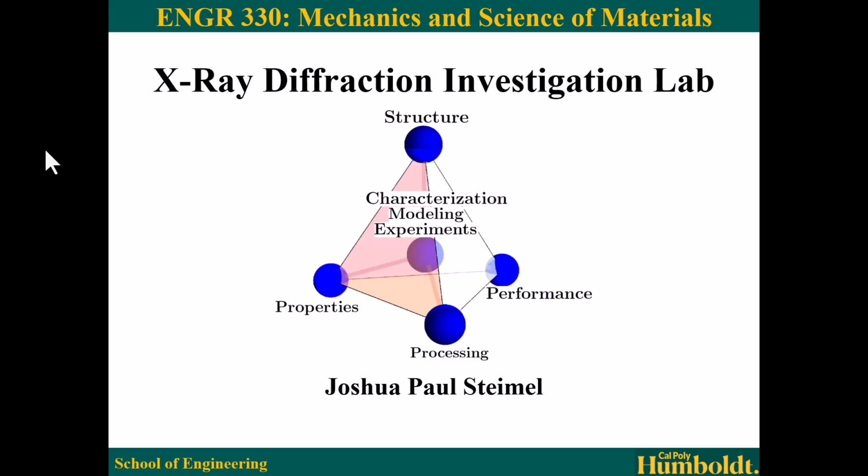So I think it's going to be a pretty engaging lab, even though we don't actually get to put the powder in the XRD. But again, we have videos to support that so that you can understand how the data was collected. So let's get to it.